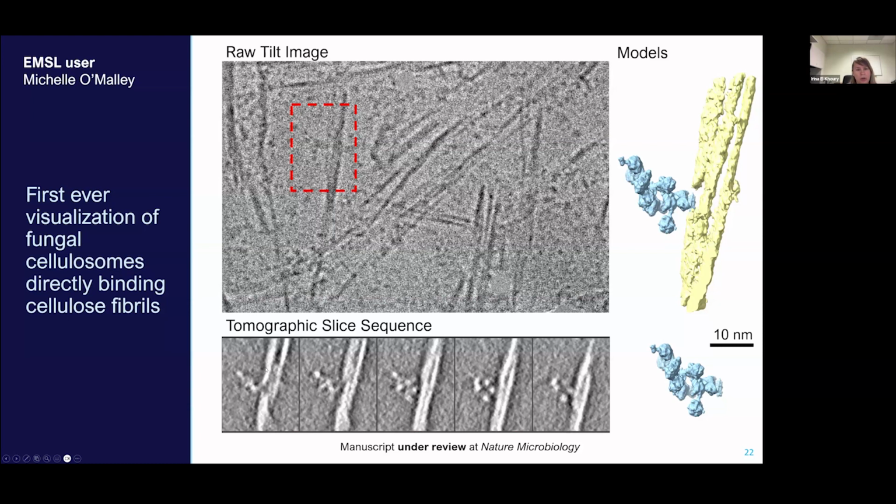So using cryo-EM tomography, with the slices that you can see at the bottom, we can reconstruct those dark densities and present a three-dimensional high resolution model. It actually looks like a man walking on a stick. Because of the nature of those complexes, they are isolated from natural isolates, so they are quite heterogeneous in terms of composition and architecture.